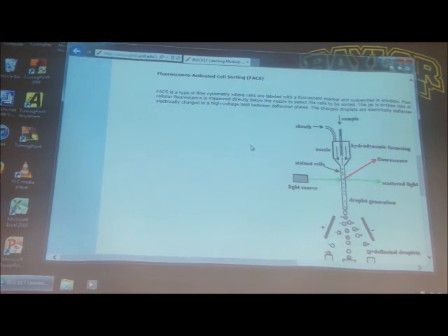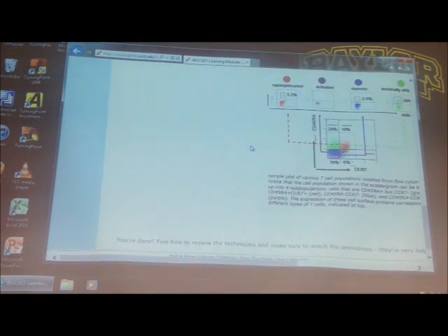Bind an antibody. Right, we'll use a fluorescent antibody. So you can go ahead and get a complex tissue mixture, add the fluorescently labeled antibody against CD4, then run it through here, and then bang, you can collect all your CD4 positive cells from a very complex tissue. It's incredible. When you stop to think about it, it's microdissection. So that's a very nice thing.